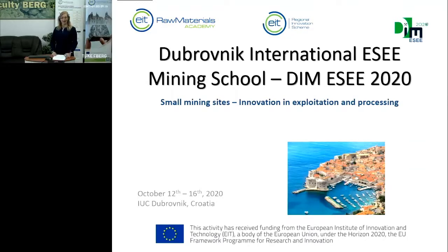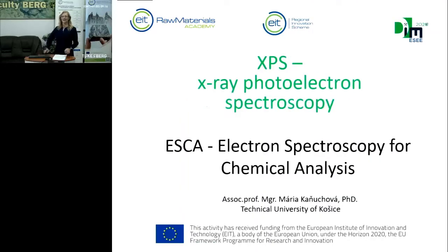I'm so glad you invited me for this event, and today I would like to tell you something about a relatively new, very nice and sophisticated method for surface analysis, X-ray photoelectron spectroscopy. Some of you maybe know this method as electron spectroscopy for chemical analysis.